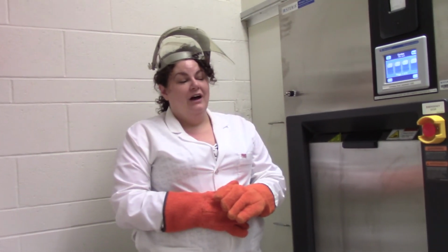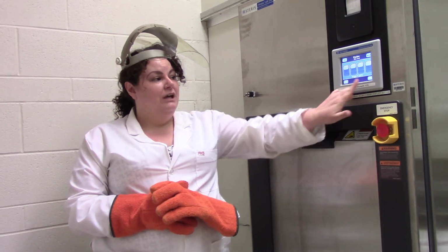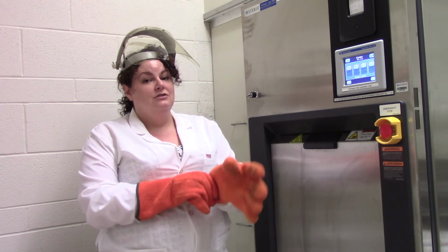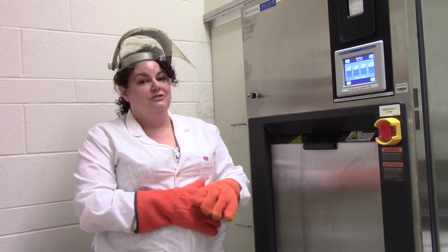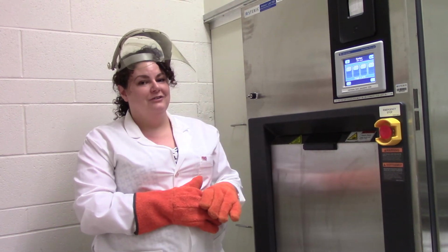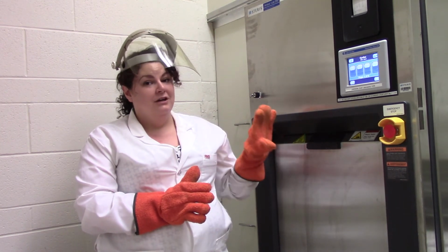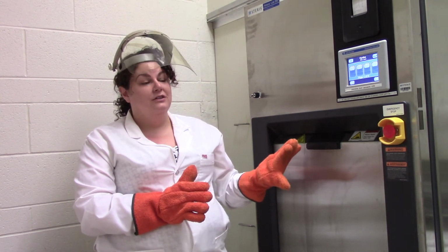So our autoclave has run its cycle, and I already hit a stop button over on here because it was beeping non-stop. You guys didn't want to hear that, so I already took care of it for you. And now that the cycle is done, I'm ready to take my materials out of the autoclave.